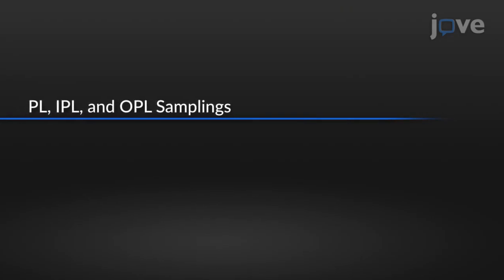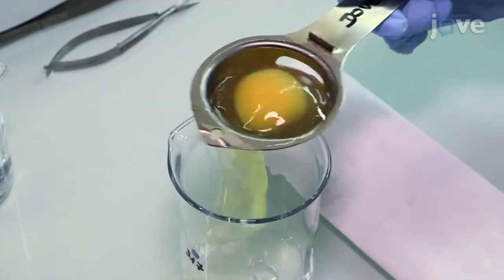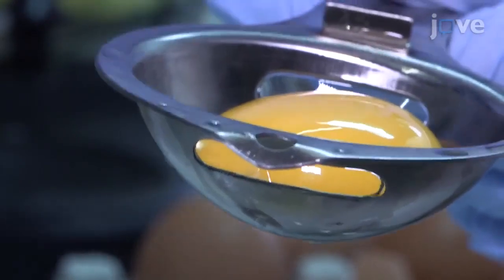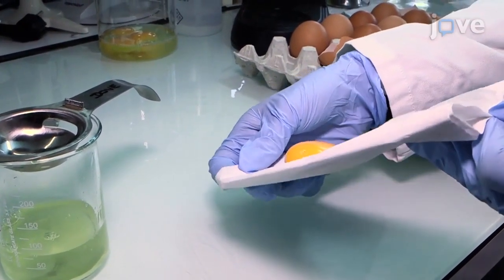Begin by sampling the perivitelline layer, or PL, from a freshly laid unfertilized egg. Break the egg, and use an egg separator to separate the yolk from the white. Remove the chalazi with small scissors, and roll the yolk over a filter paper to remove adherent albumin that appears as a transparent but visible structure.